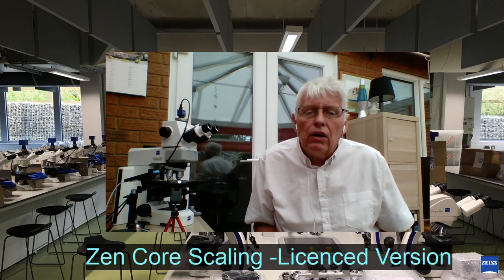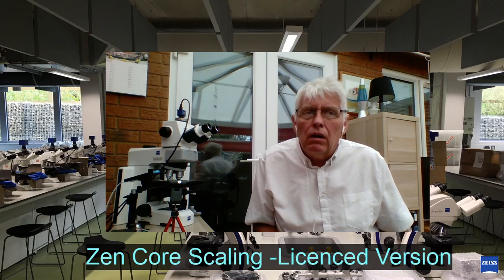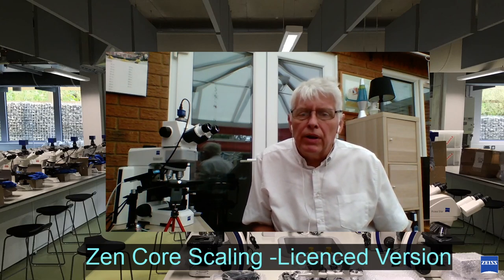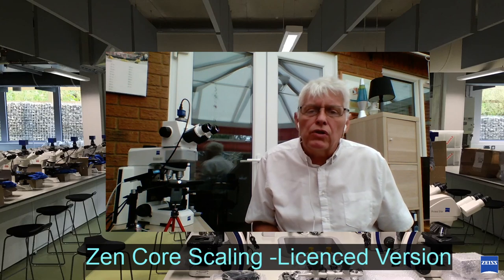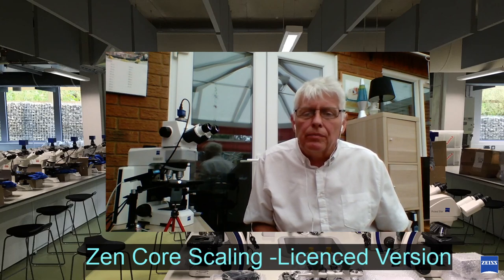So today, talking about Zen Core scaling, and this is for the licensed version of Zen. There are unlicensed versions which have different menus, but the licensed version of Zen requires that you set up some extra parameters, and in some ways it's easier because you get some interactive graphics that you can work with.